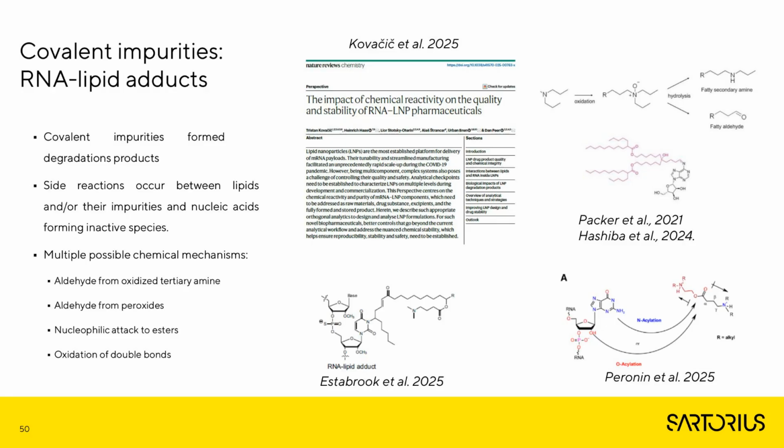To spend just a minute on the RNA lipid adducts, which we think are very important impurities formed within these formulations.